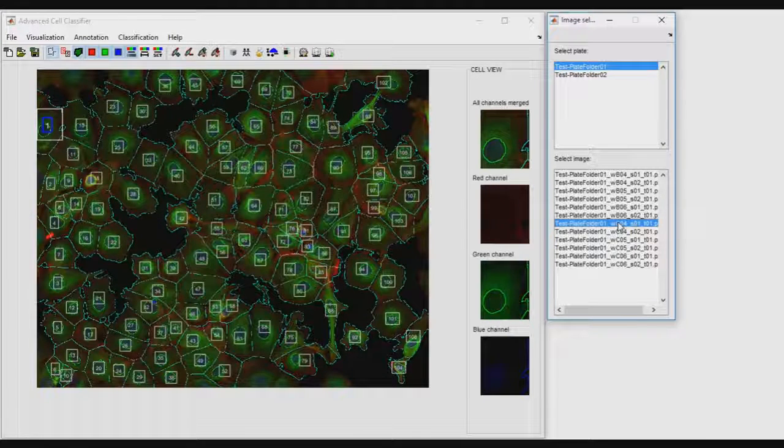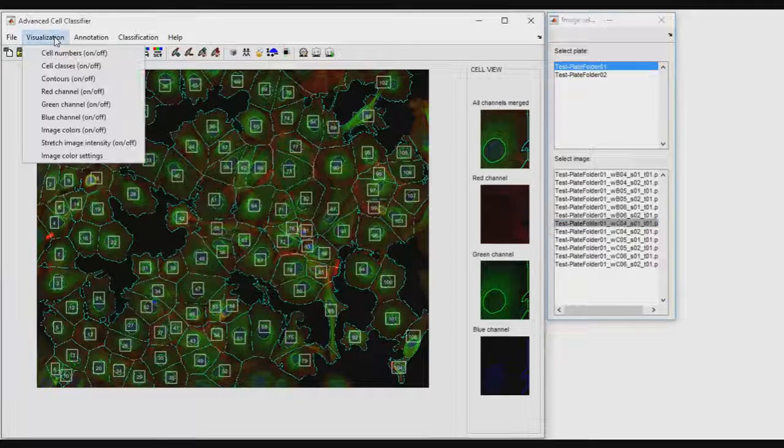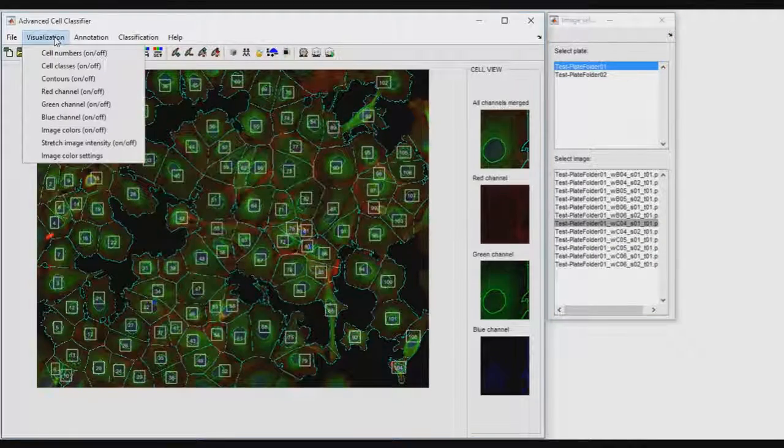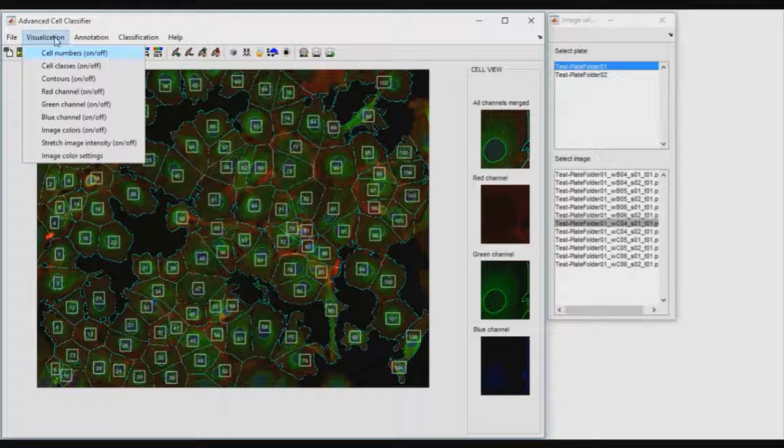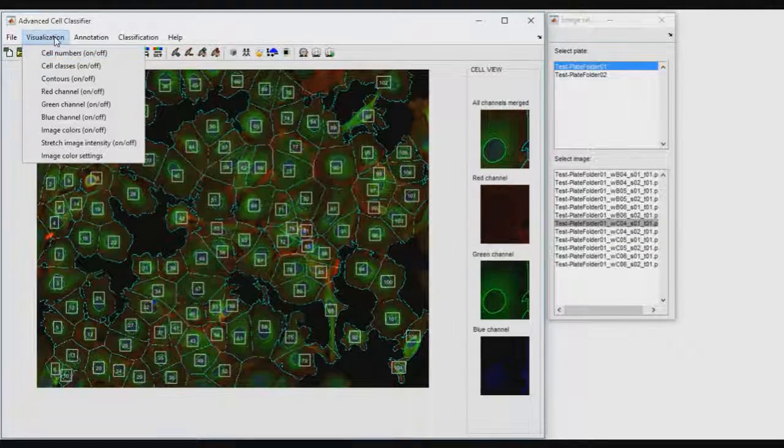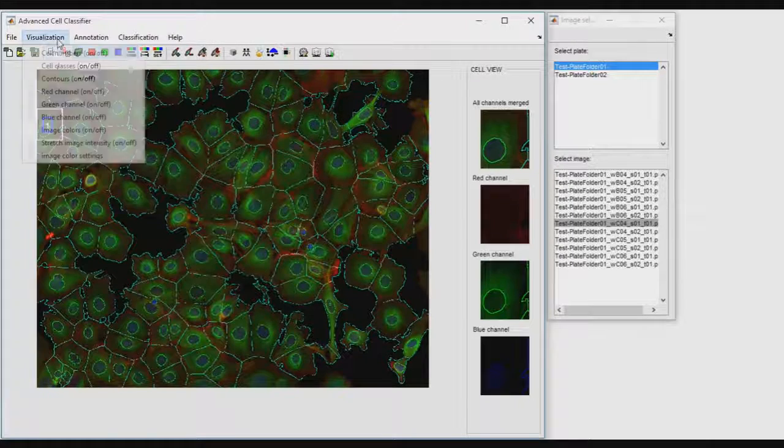When a dataset is loaded, the Image Selector window will appear to help the user browse and analyze the images. Several visualization options are available to improve the appearance of your images.